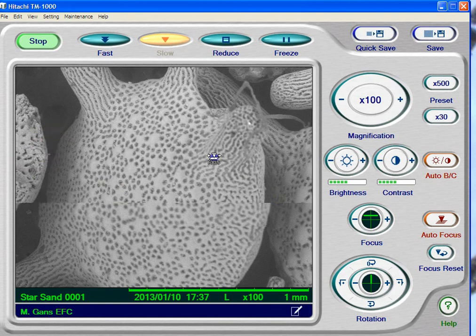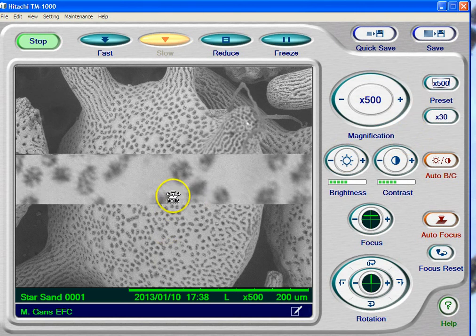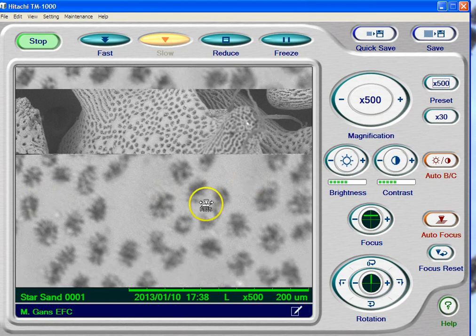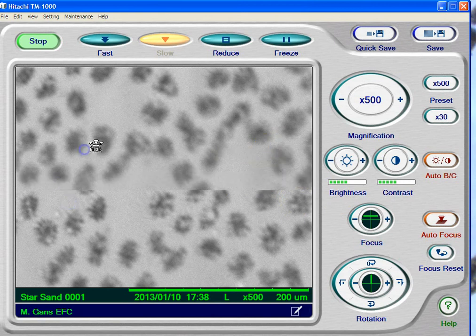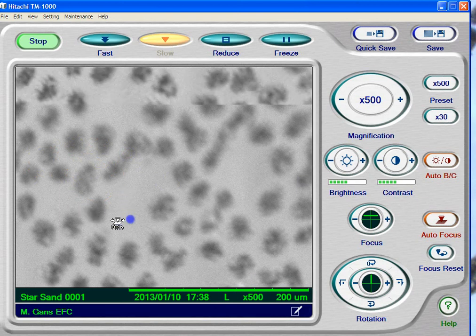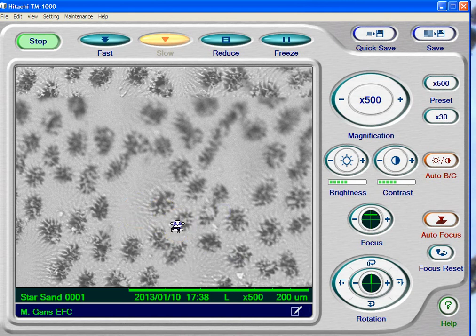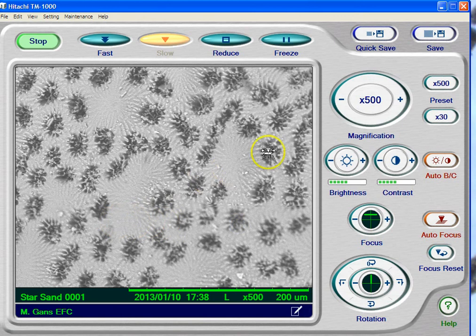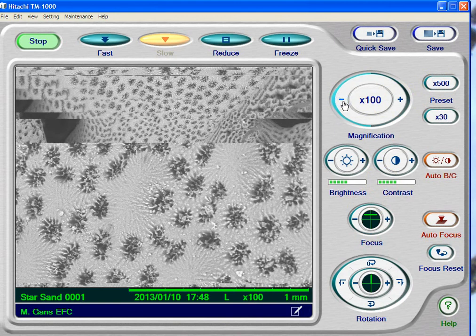Unlike photography, there's a trick to get a very sharp focus — you can actually magnify much more than you actually need. Let's go to 500x on slow scan to get the highest quality image. Let it do one complete pass so you have an image to compare. I'm going to start dragging across and asking myself: is it getting better or worse? It's getting worse, so I'll start over here on the left and drag back to the right. You can do little short drags and watch just behind the scan line for the best image. And look at that — very nice. Oftentimes you need to go a little bit past it and come back. Now I'm going back to 100x, and you'll notice we have a very sharp image — we focused it above the magnification.